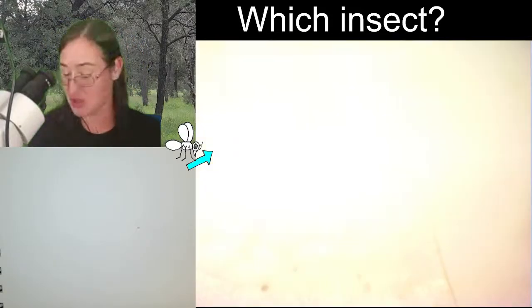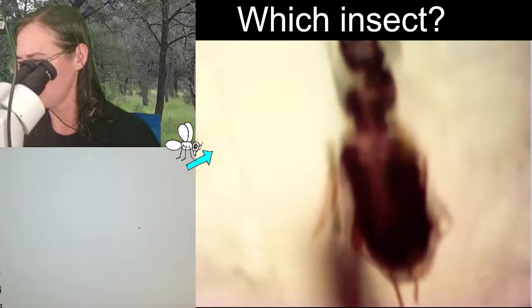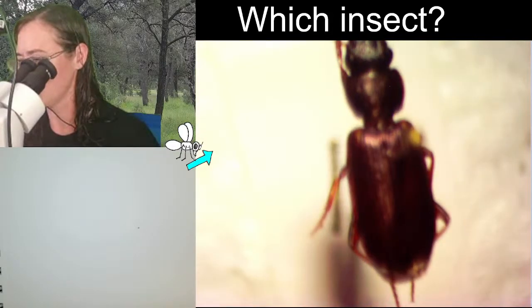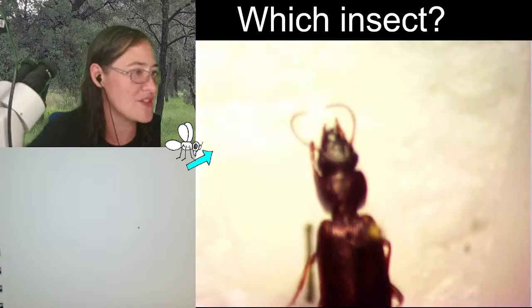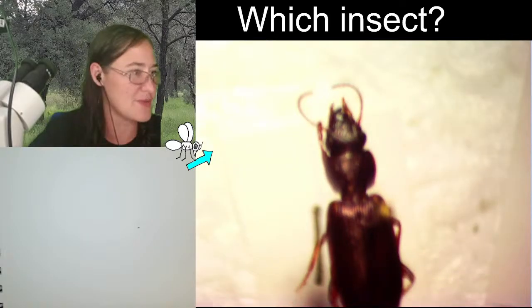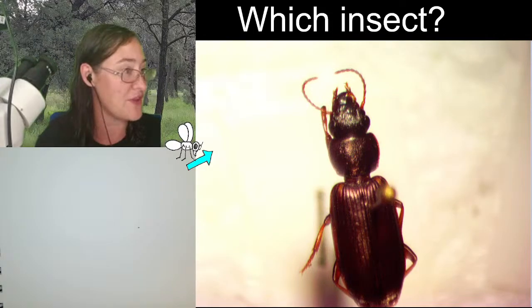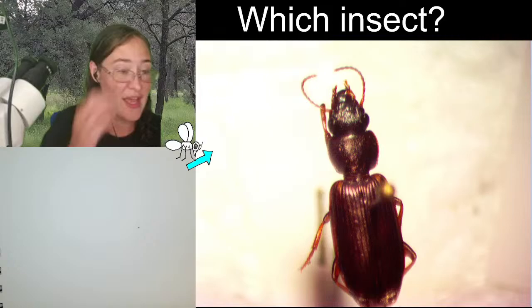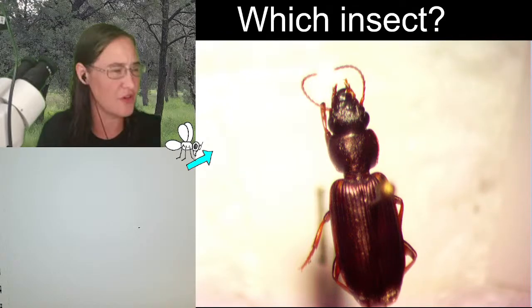other two specimens. This carabid here, this is a carabid here. He's this long cylindrical friend. I wouldn't know much more about this specimen other than down to family. I can tell you that he's predatory, and I can show you what characteristic I look at to determine the family level identification for carabidae. I believe, well, I've shown you the expanded trochanter on other carabids, but we can show you that again.